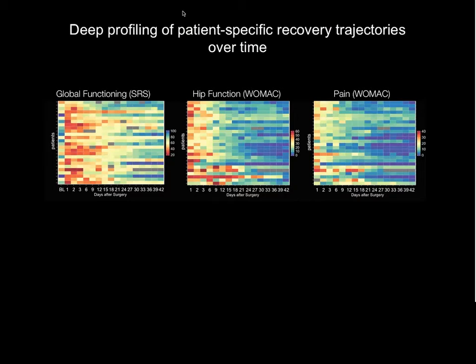And what we can see is, while ultimately most patients do recover, you definitely see this sort of wide range in the recovery time. And so really our question was, could we predict from early immune responses that we were measuring by CyTOF sort of what camp you're going to fall into, how long it was going to take for you to recover on these 3 metrics of clinical recovery?